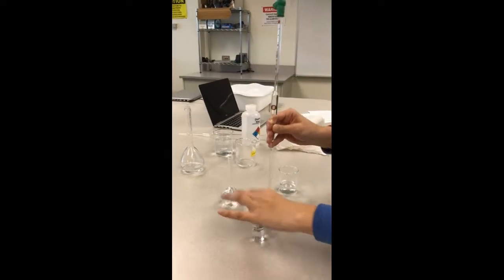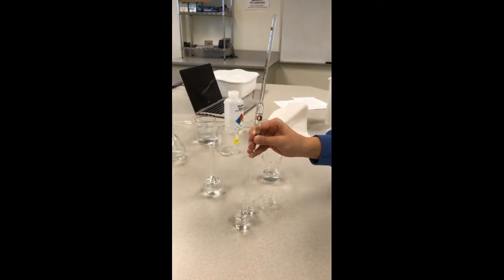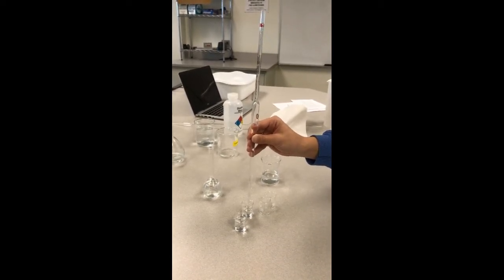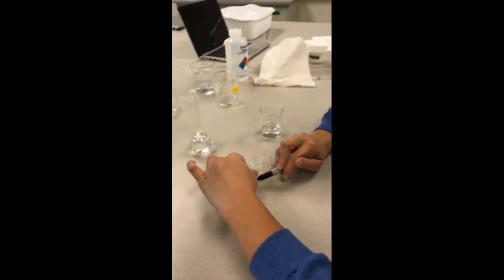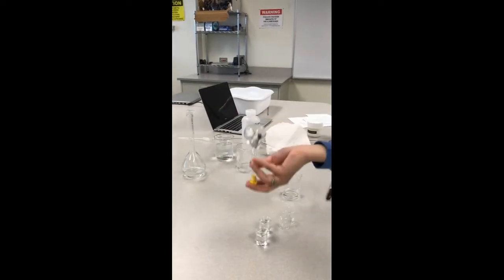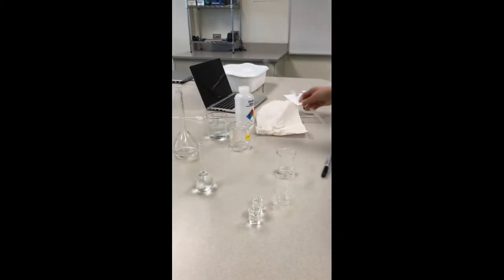We're going to put this into our second beaker. And we will label this beaker A for dilution A. And we're just going to repeat the same process we did for the first dilution. And we will repeat this process one more time for our third and final dilution.